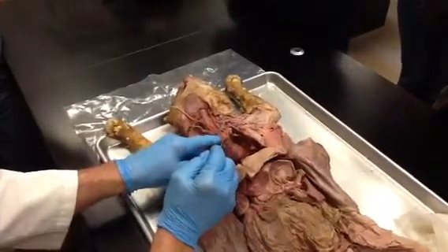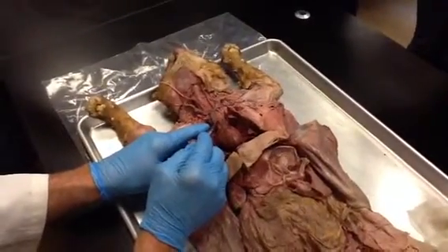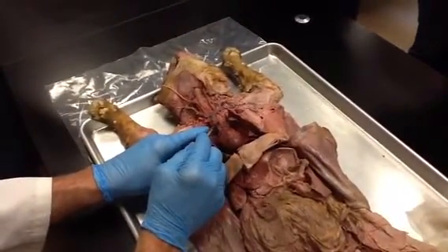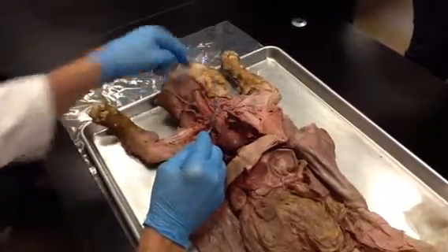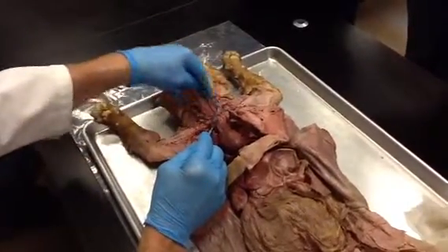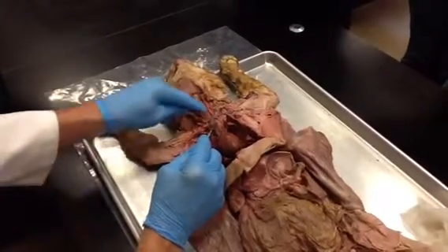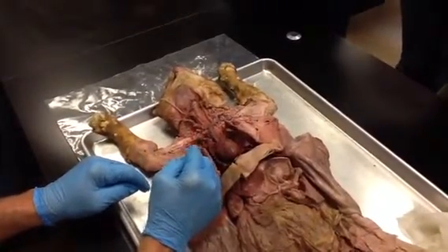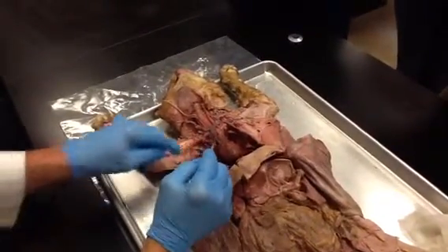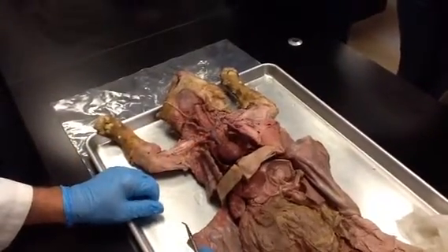Let's go back to the brachiocephalic. The brachiocephalic actually branches 3 times about right here. This one right here continues up on the left side of the neck. So this is my left common carotid, this is my right common carotid, and here is my right subclavian. 3 vessels that branch from the brachiocephalic of the cat.